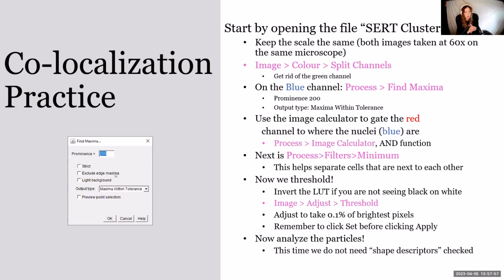So in the larger macro as well for the blue nuclei, we also care about what shape the nuclei are because they are lymphocytes. So we've also applied exclusion criteria that will get rid of cells that don't have a nuclei of the correct shape to make sure we are actually looking at lymphocytes.